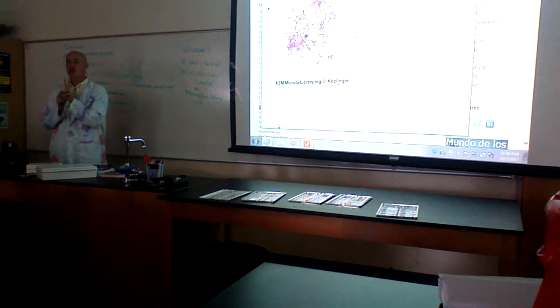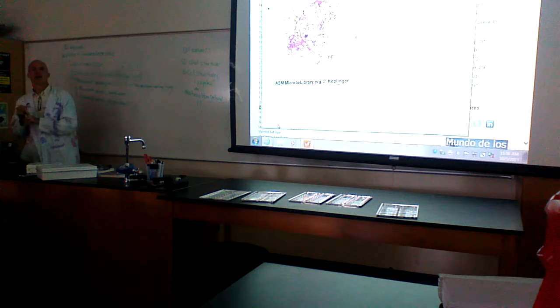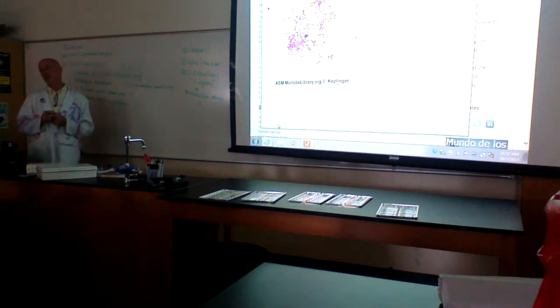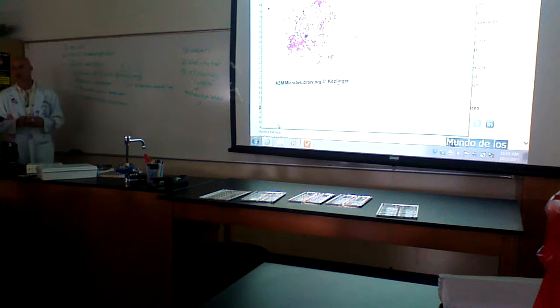So the only two genera on the planet that we are aware of, genera is the plural of genus, that have acid fast cell walls are Mycobacterium, so that's where you have Mycobacterium tuberculosis, right? So this is a test you would do to see if somebody has tuberculosis, or Nocardia, which is a soil bacteria. People that are immune deficient sometimes get this, but it's very, very rare. The reason you did this is because tuberculosis is a huge problem outside of the United States, right? And it wouldn't be surprising if it came our way in a drug-resistant way.